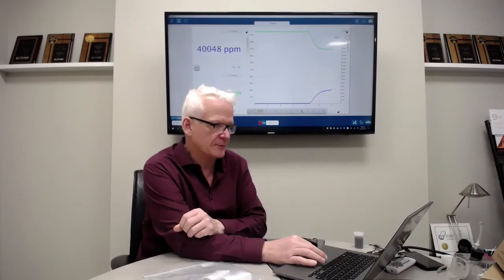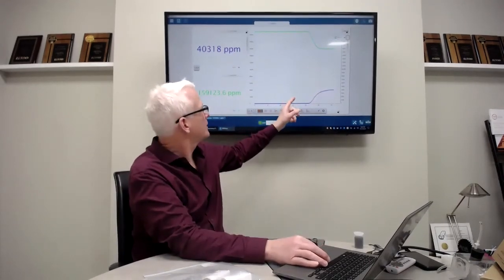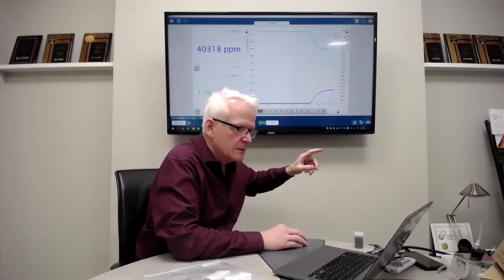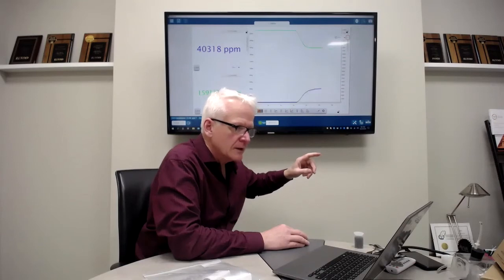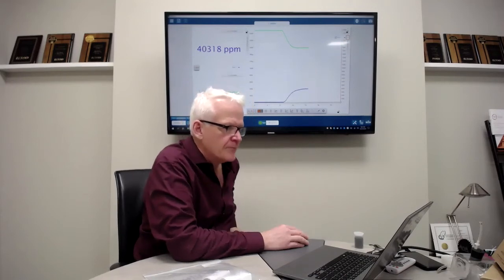I'm going to hit stop right there. If I take my cursor here, I can move the graph, like this, and get that part right there. And just look at that.